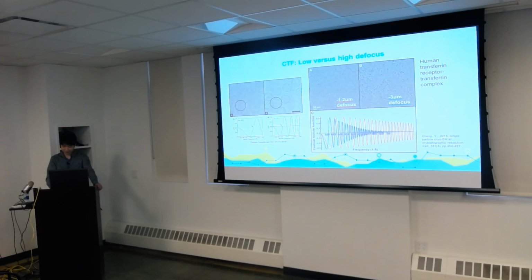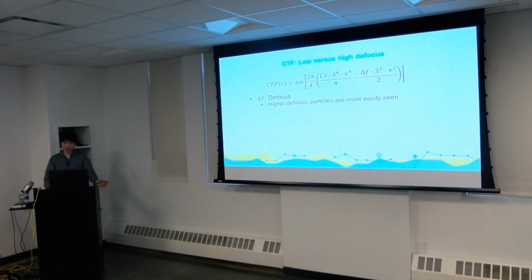So this is the first concept. I'd like to reiterate that the reason why we defocus in a microscope is that normally you don't see your particles if you don't defocus in cryo-EM. You need to put some defocus, and then you will see them and can do things with them, like pick them, because if you can't see your particles, you can't do anything with them.